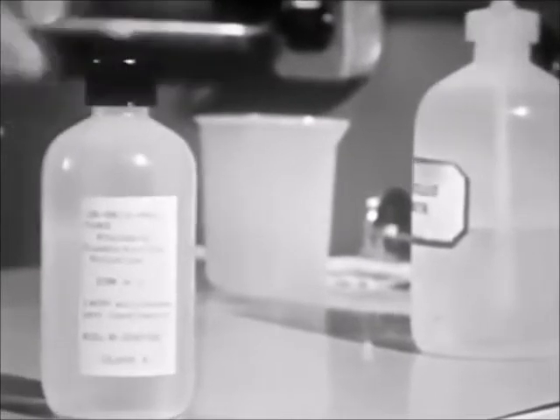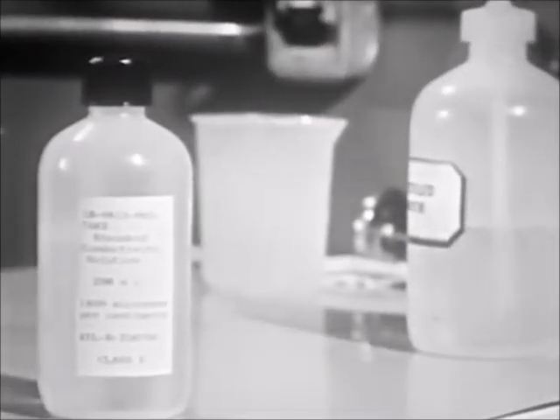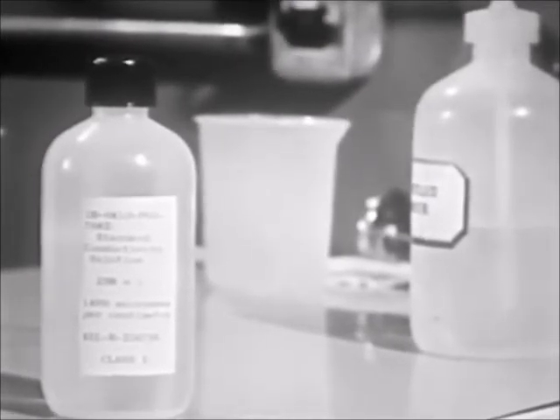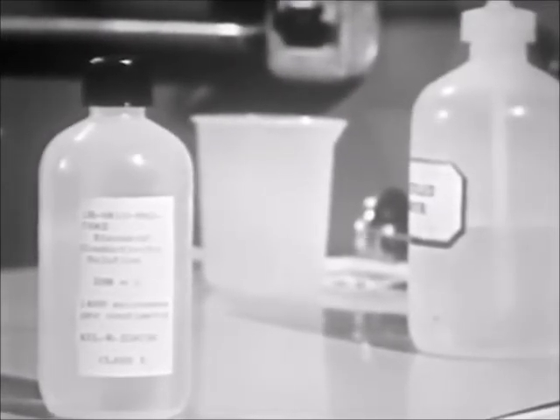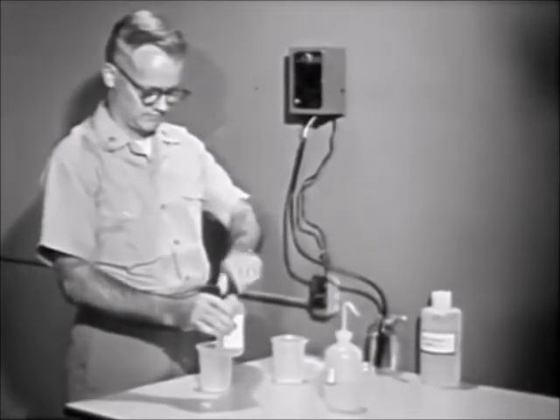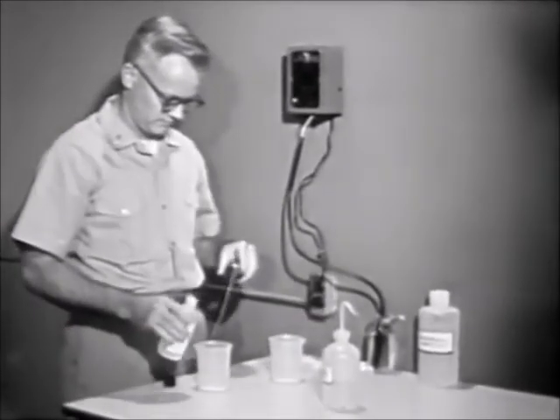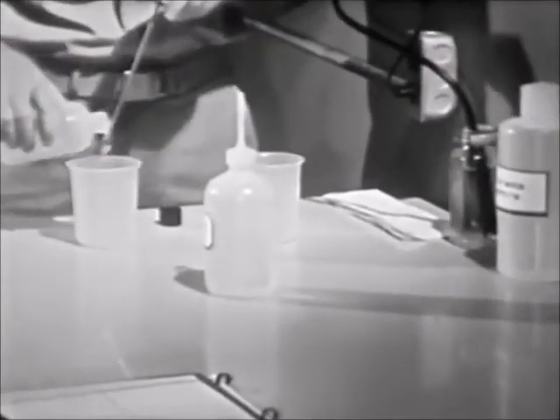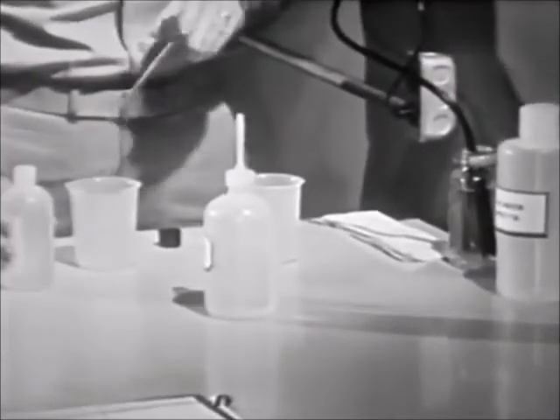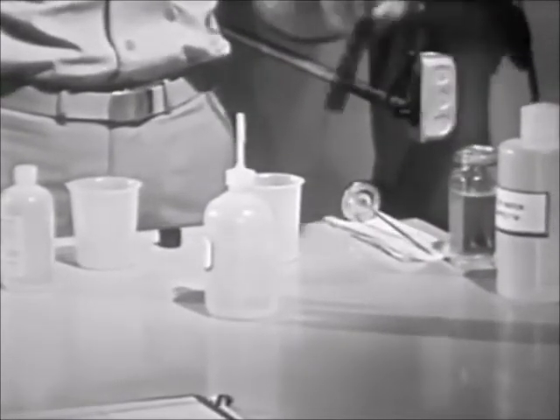If this does not correct the problem, run a test on the accuracy of the meter and cell using Class I standard conductivity solution. This has a standard conductivity value of 1400 micromhos per centimeter. The results obtained with this solution should be in the range of 1300 to 1500 micromhos per centimeter. If they are not within these limits, or if the tuning eye cannot be sharply balanced, contact a shipyard chemist at the earliest opportunity for assistance in locating the source of error.